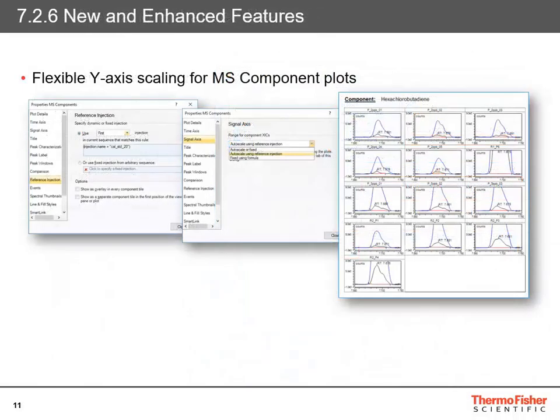We've also introduced flexible scaling on the y-axis for your MS component plots. Previously it just auto-scaled to the biggest peak, which meant some traces came out quite small. Now you can have more control over the y-axis and specify zooming by auto-scaling, basing it on a reference injection, or a particular formula, allowing you to better see what's happening in your component plots.